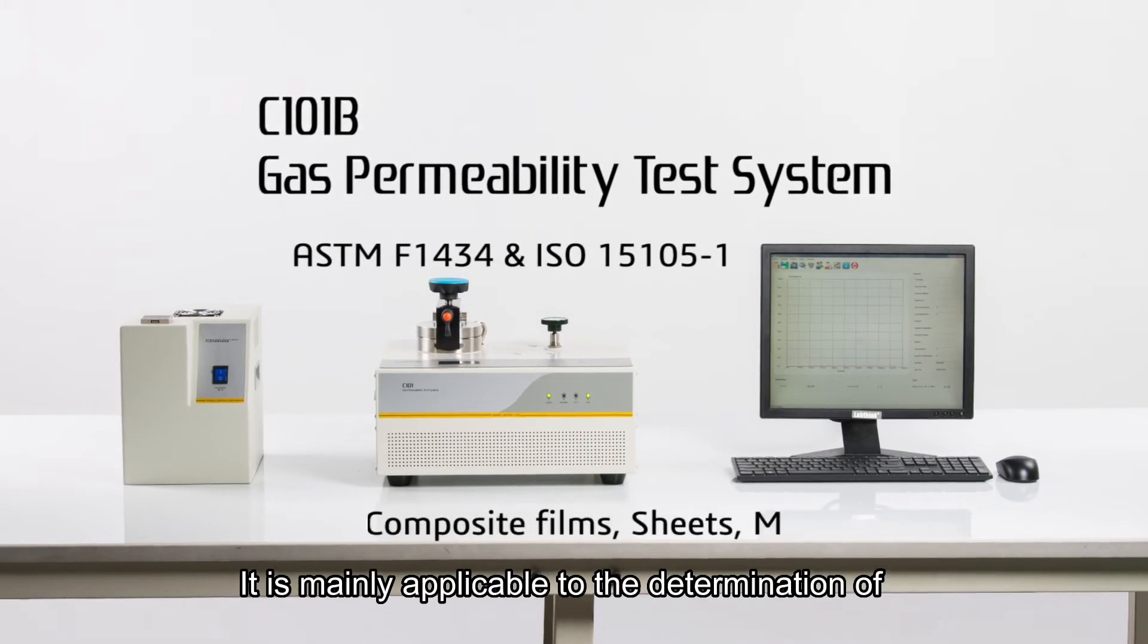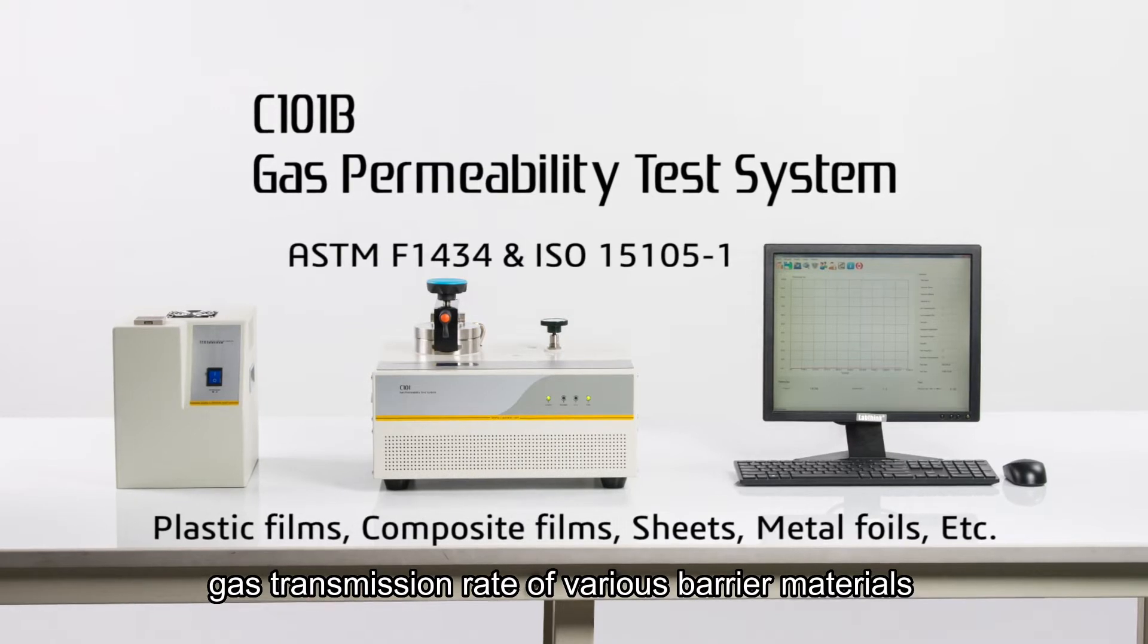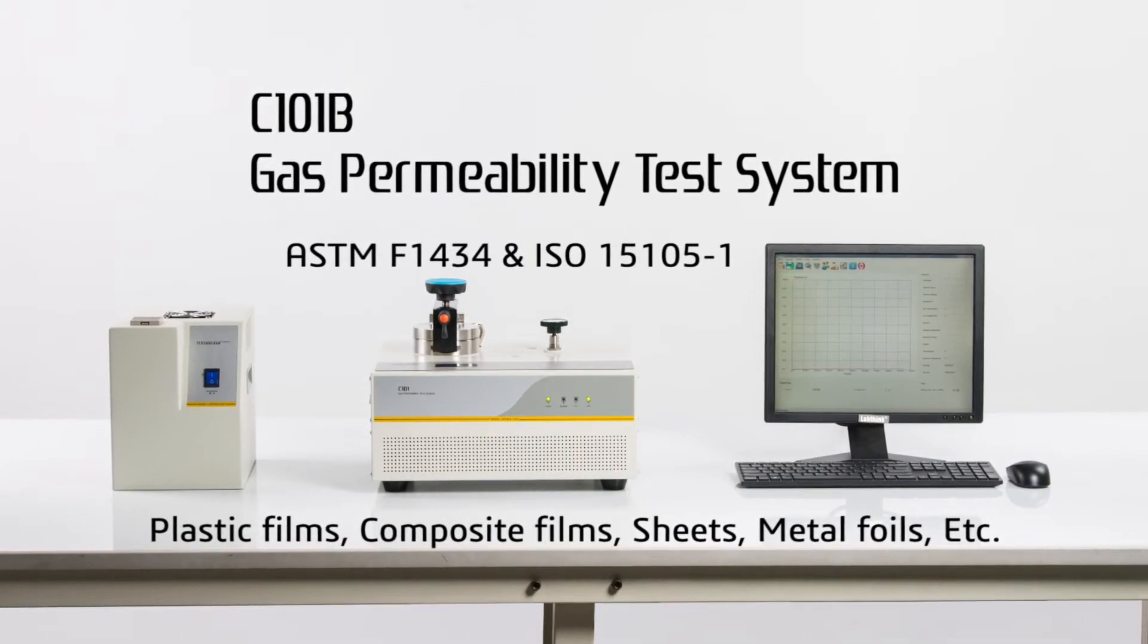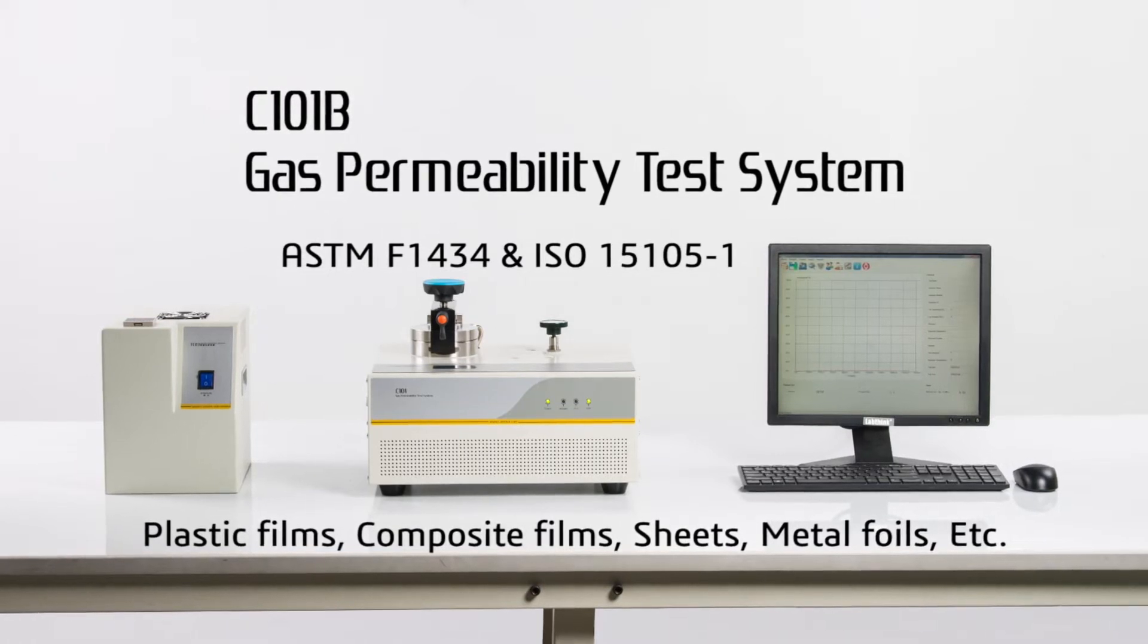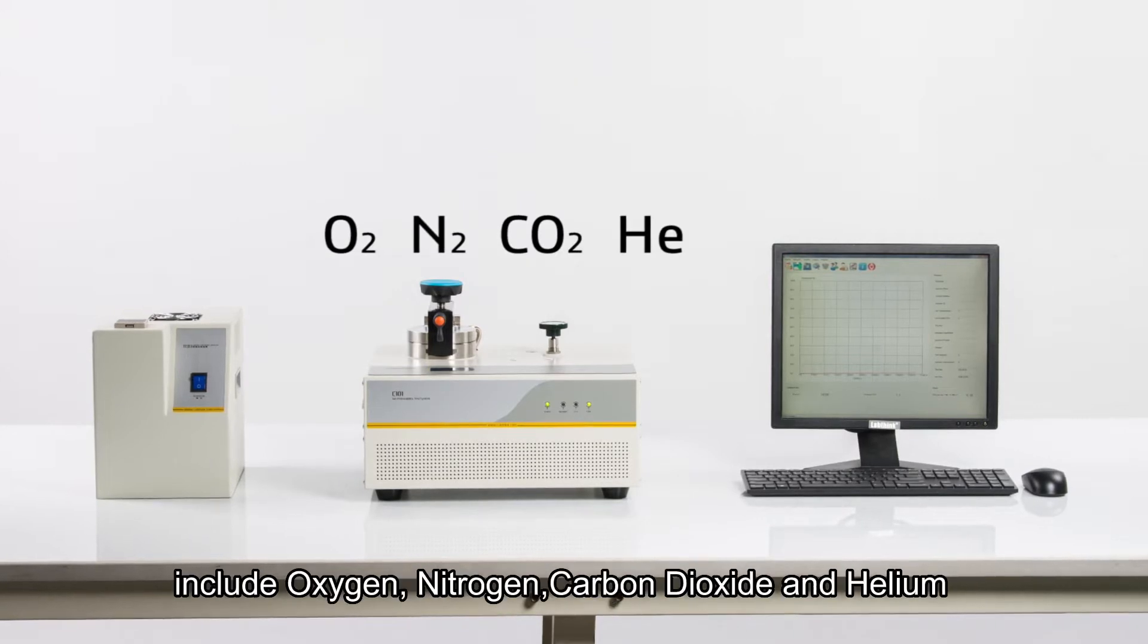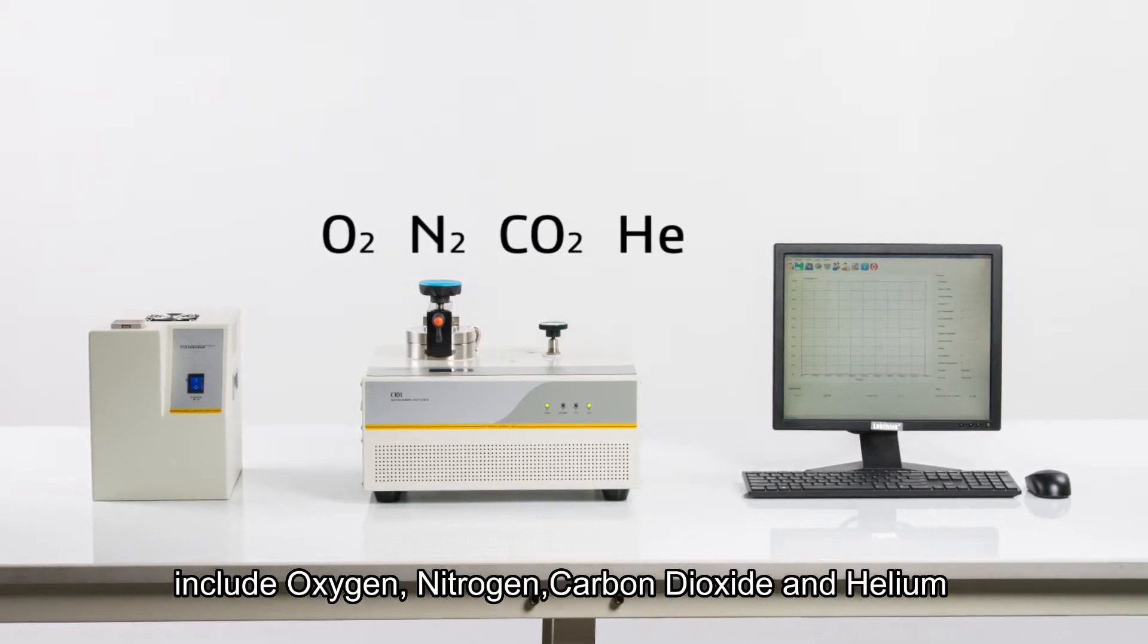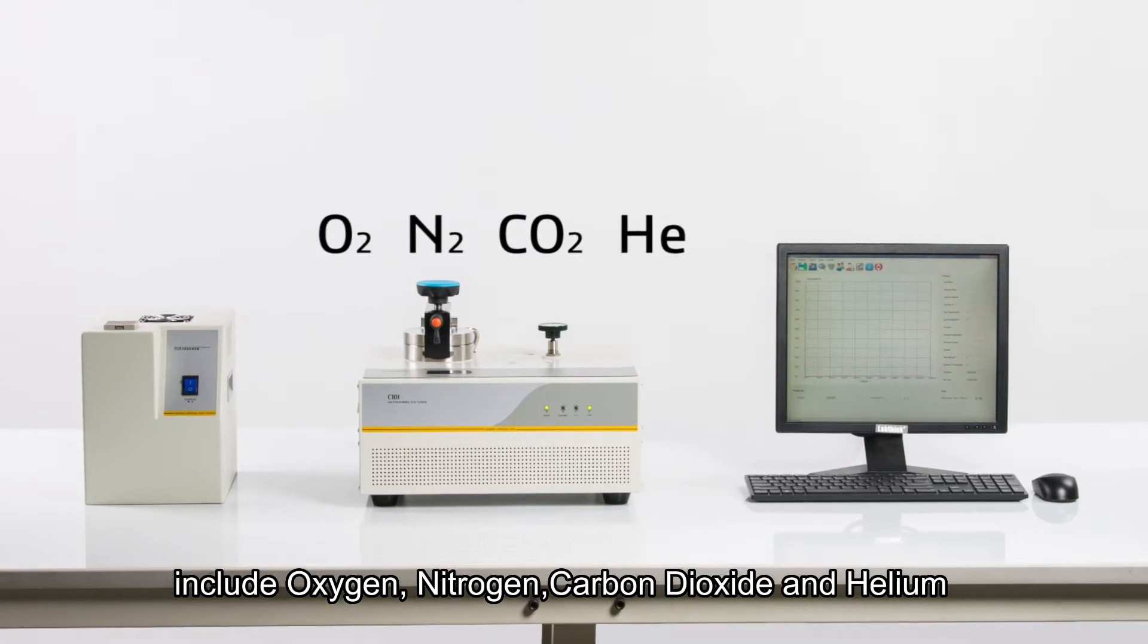It is mainly applicable to the determination of gas transmission rate of various barrier materials, such as plastic films, composite films, sheets, metal foils, etc. The commonly used test gases for the model include oxygen, nitrogen, carbon dioxide, and helium.